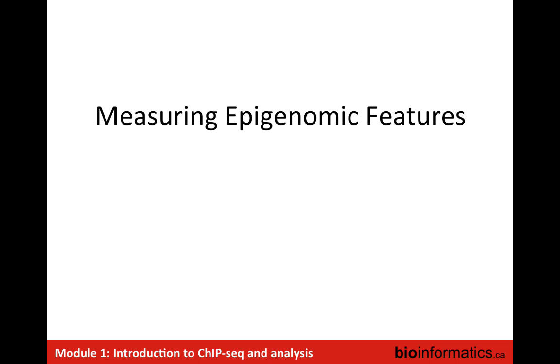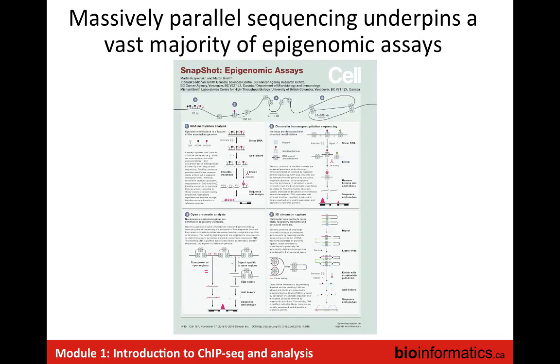Okay, that's about the first 20 minutes. So now I'm going to move into how we measure epigenomic features. In particular, I'm going to focus on ChIP sequencing, and of course, Guillaume is going to focus on whole genome bisulfite sequencing. If there are other epigenetic assays that folks would like to discuss, we're here and I'm happy to discuss them. In the interest of time, I can't go through all of them, so I've decided to focus on histone modifications. But we're here for the next couple of days, and I'd certainly be happy to talk with anybody about your individual assay.